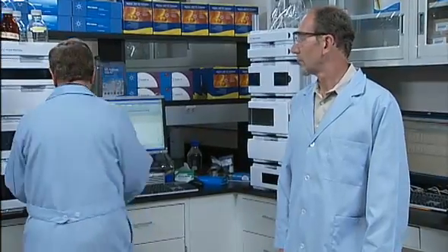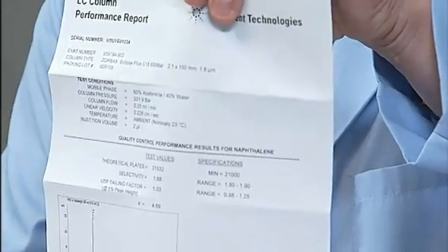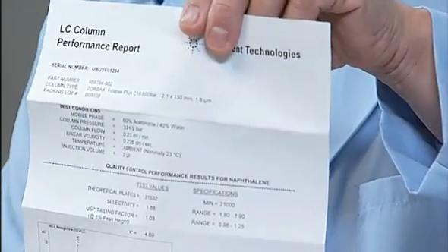From a columns perspective, here's a good practice we recommend to help you evaluate your column performance. Run a test chromatogram using your own column right out of the box. Start by looking at the test chromatogram that comes with your column. You could get these test components, which are easily found in chemical catalogs, and run them on your instrument with your new column to compare. That will help you identify if you have any system issues that are keeping you from getting optimum results. Some people prefer to use their own sample or a standard because the test mix may not be relevant to their applications. Or you can run a test on the method you're typically running and keep that in your logbook.